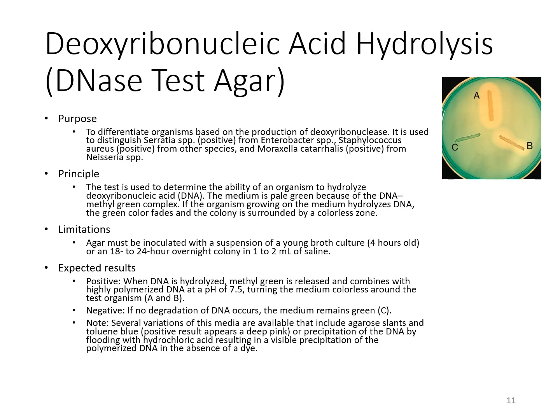The DNase test is looking for an organism's ability to produce deoxyribonuclease. And so there's actually a video that's loaded in the lab section that shows this test, but the method is a little bit different. But he does demonstrate what you're actually looking for.